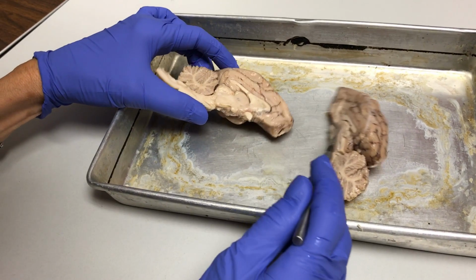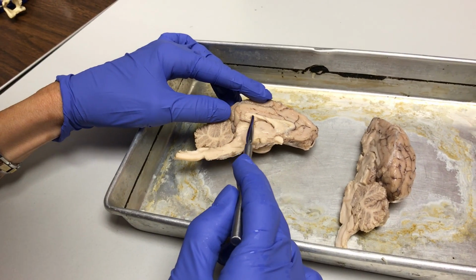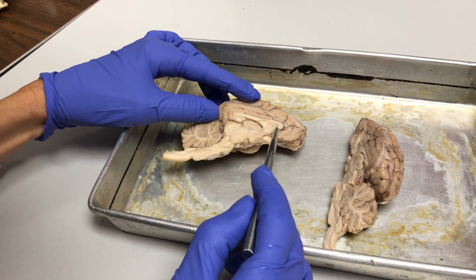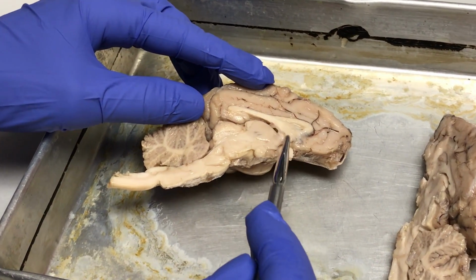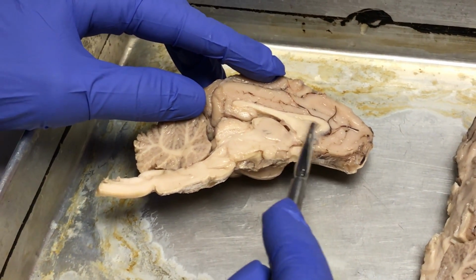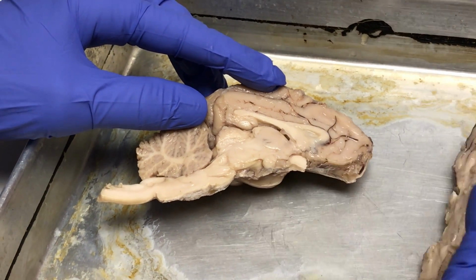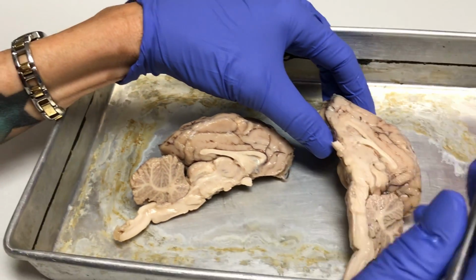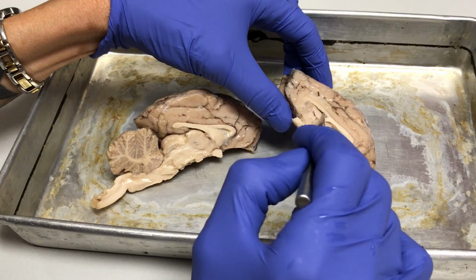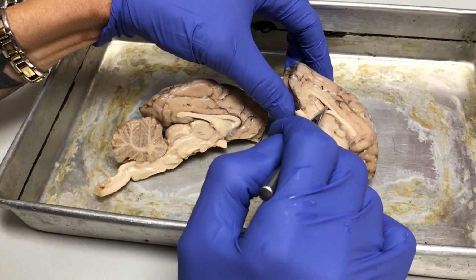Alrighty, so let's start here with the corpus callosum. You guys know that's the corpus callosum, right? Okay, and then this tract coming down is the fornix. And between them, that membrane is the septum pellucidum, right? And so you guys know if you put your pipe cleaner through there, it goes into the lateral ventricle, right? That's where the lateral ventricle would be.